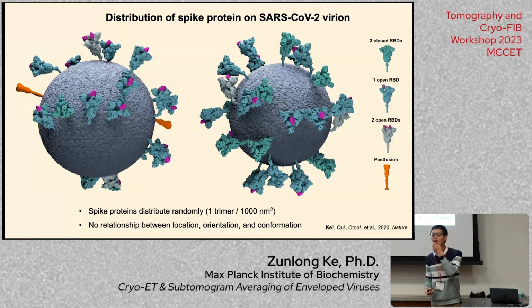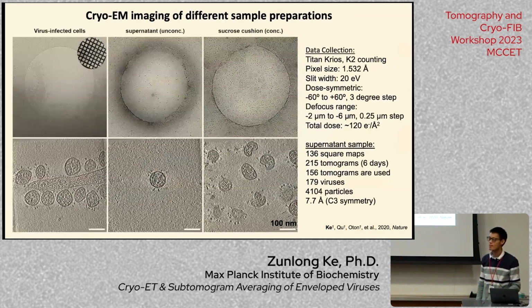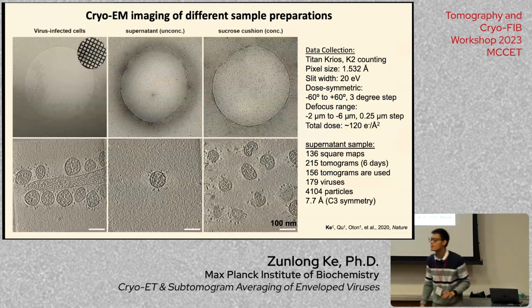So you mentioned in the beginning, when you were talking about your process for getting the sample, that it was hard to get images with the infected cells versus centrifuging them. So I guess I'm just curious if you could go through doing this data collection on infected cells, like how you can circumvent the issues aside from just centrifuging and pelleting.